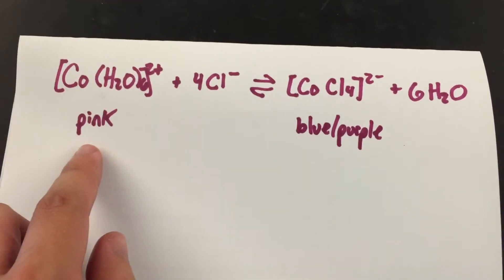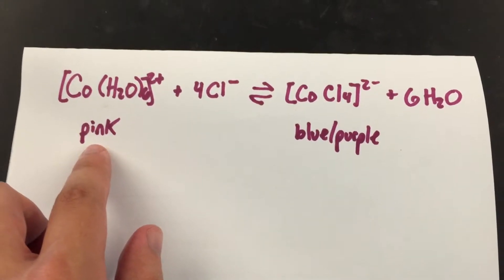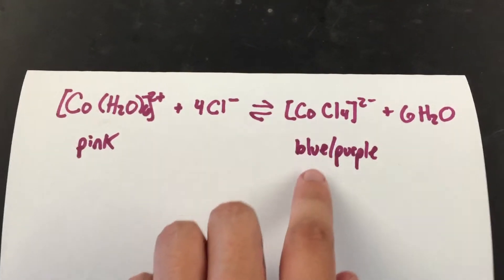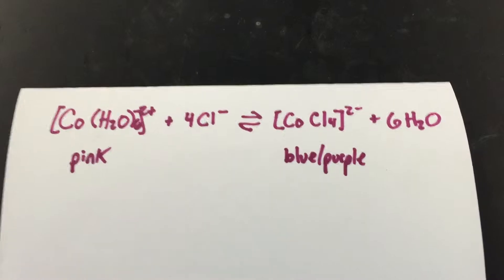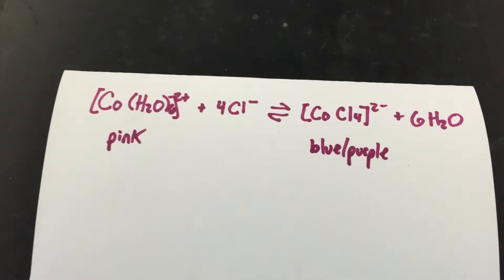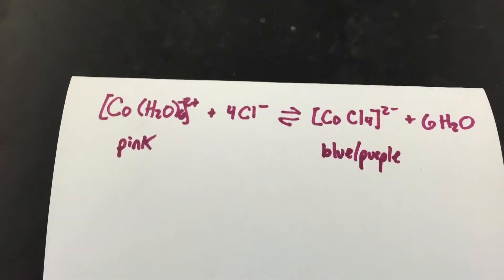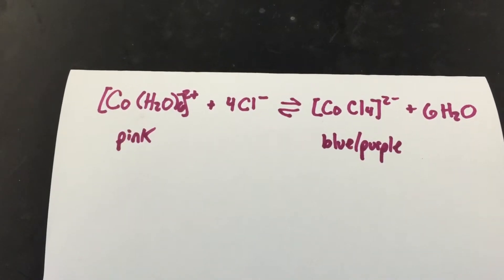I have a cobalt complex which has a pink color, and a cobalt complex that has a blue or purple color, depending on how this solution is made. In our case, it looks a little bit more purple.